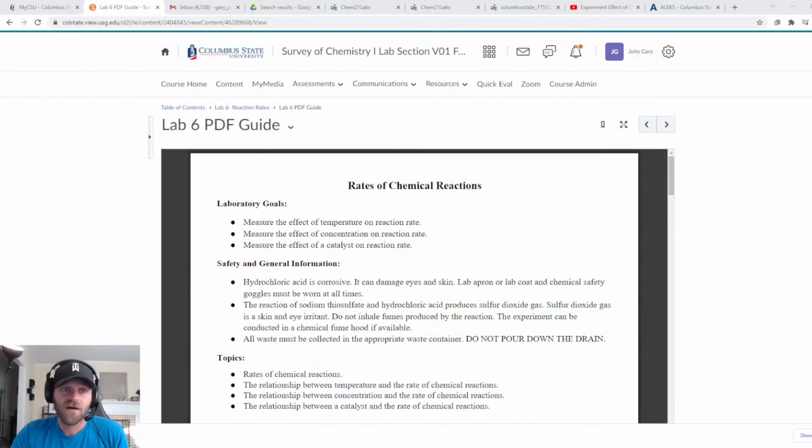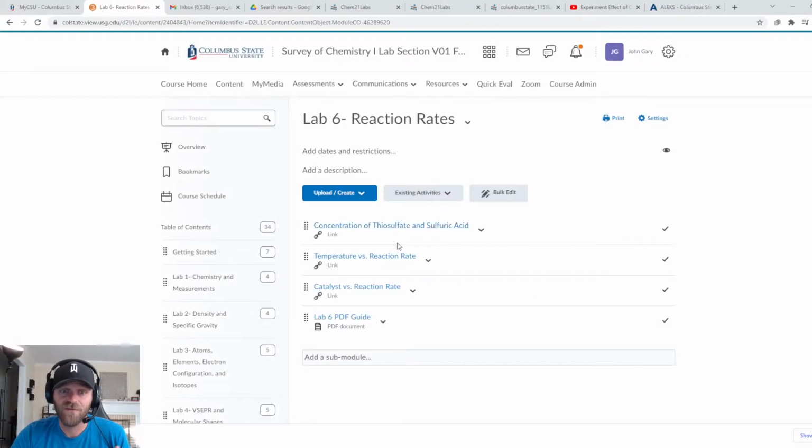All right, hey everyone. So this is essentially the walkthrough for Lab 6. Now, I didn't ever get the live videos from CSU for what they've done there. So what I've done, like other labs that I've done this semester, is I've gone in and uploaded experiments from YouTube that are very similar to what we do in our labs.